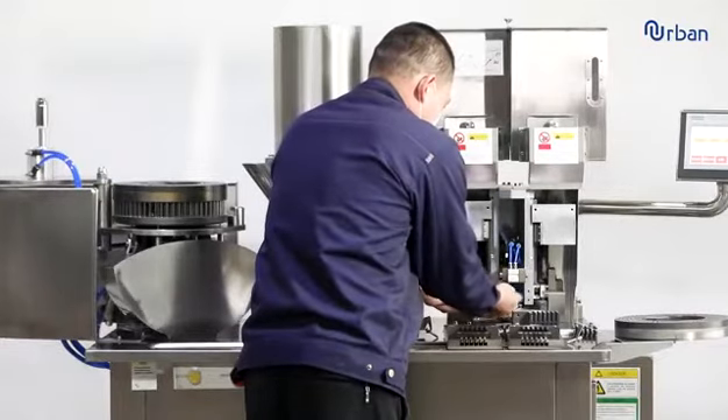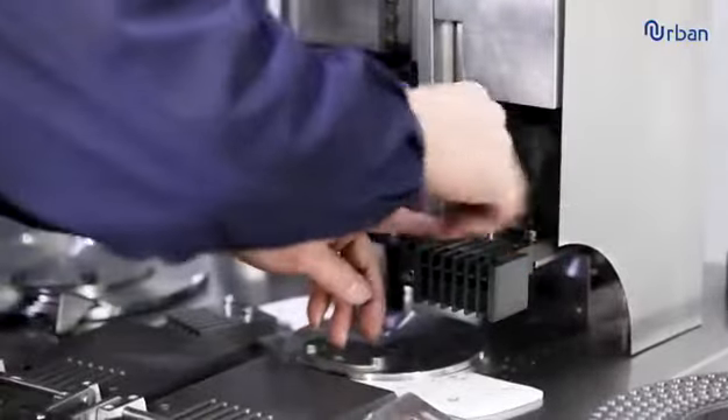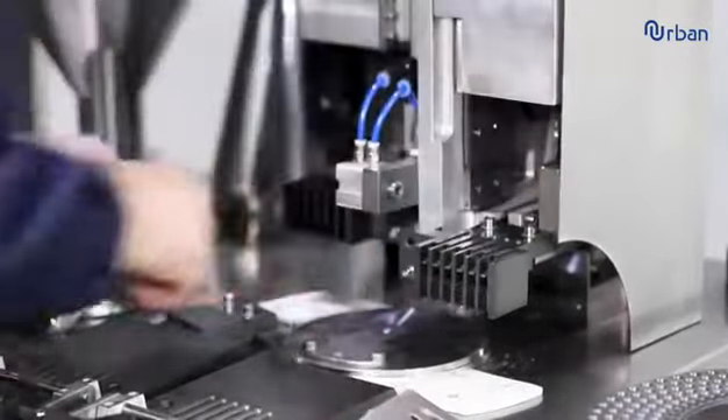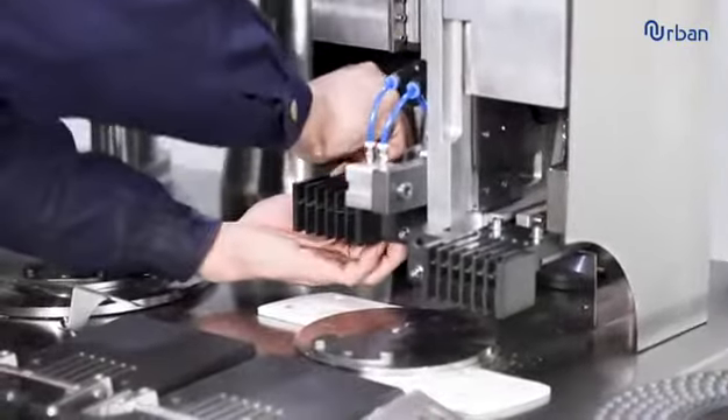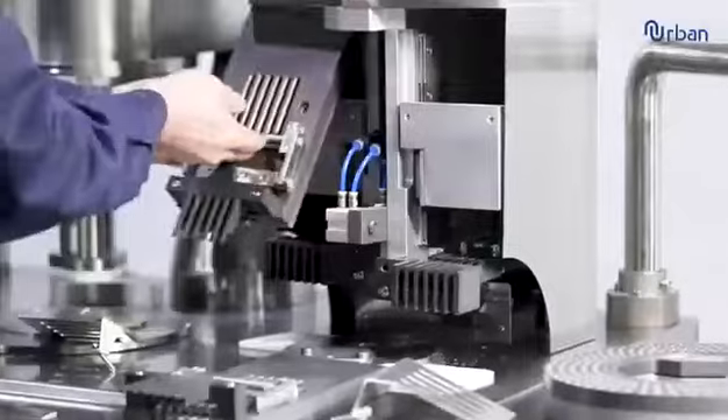The new semi-automatic double head capsule filling machine is a device with manual and automatic parts for filling empty capsules. Its installation and mold replacement process is relatively easy to operate.